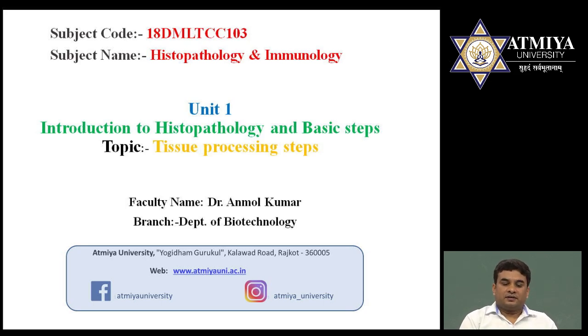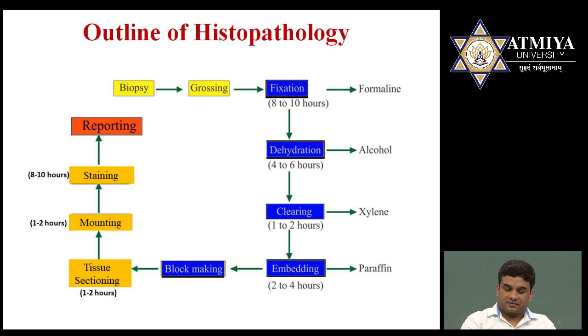Today, I will take the topic of tissue processing steps. This tissue processing steps also belongs to the first unit, the introduction of histopathology and basic steps.